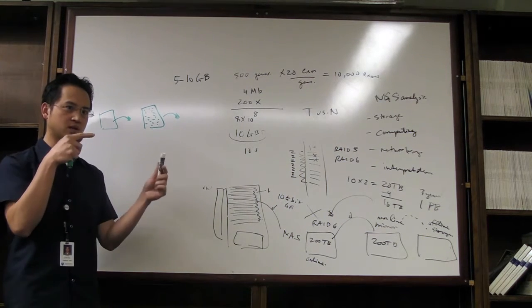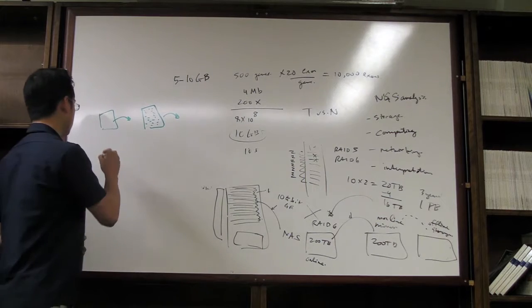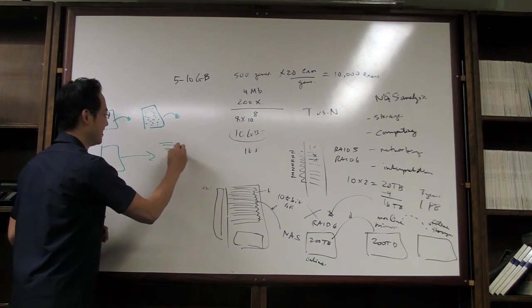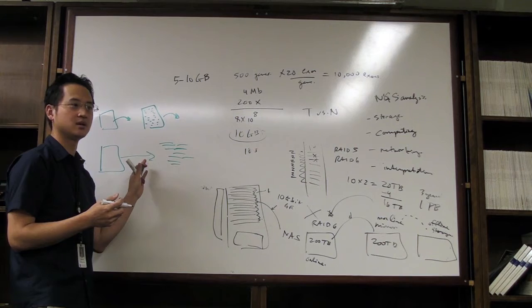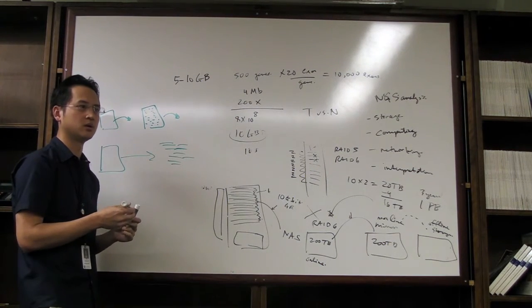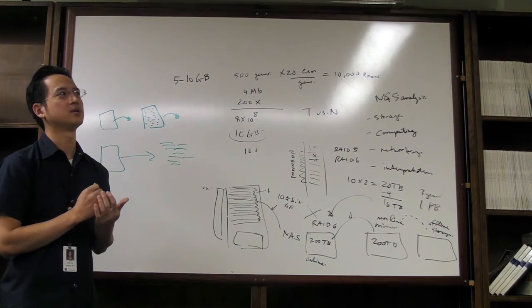There are no intermediate steps of transfer, so what Alice is talking about is you do your sequencing, and bam, you get a mapped file directly out of the sequencer. In the future, that might be the case, where you don't have to transfer the data somewhere else to have it interpreted. It's almost like, what's the best example I can give?